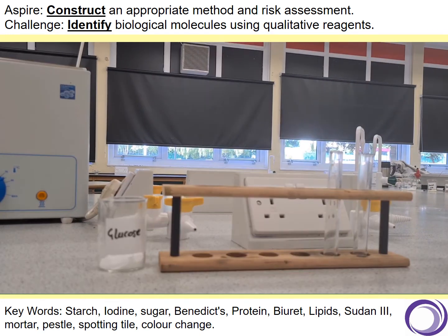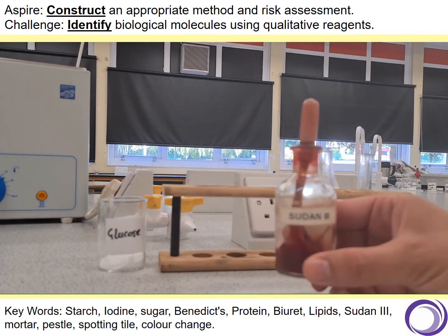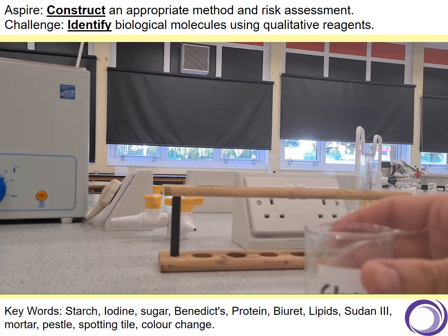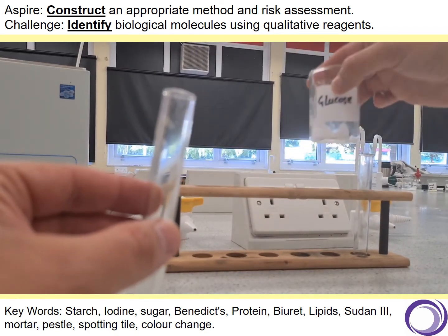The other test that you can do for lipids or fats is that you can add this substance called Sudan III. Okay, and all you need to do is put your solutions you are testing. So I'm going to put in some glucose into a test tube and add some water.